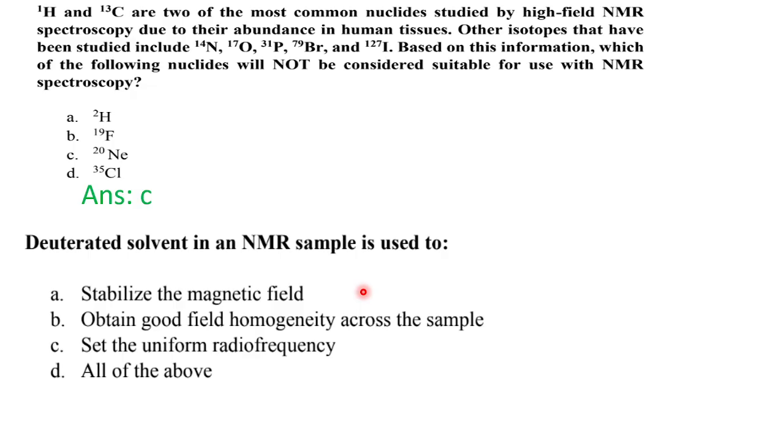But still, for every NMR solvent, you will get a specific peak. For example, if you are using CDCl3, you will get a very sharp peak around 7. Okay. If you are using DMSO-d6, you will get a very sharp peak around 2.5. Now, why? The thing is, whenever you are using deuterated substitution, it is not possible to substitute 100%.